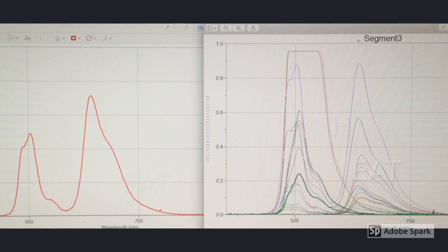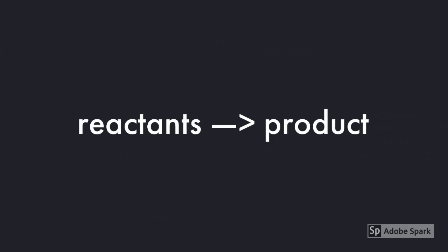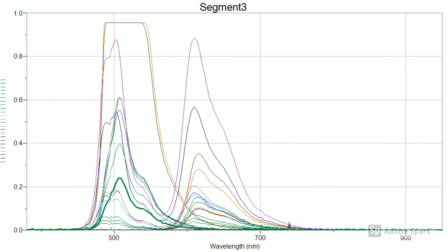the dyes after heating. After some time, the concentration of the reactants, the dye and activator, decreases, since most of the reactants have turned to product. This means less photons are being released, so the intensity peaks also decrease, despite the addition of heat. This trend continues until one of the products runs out and the reaction stops.